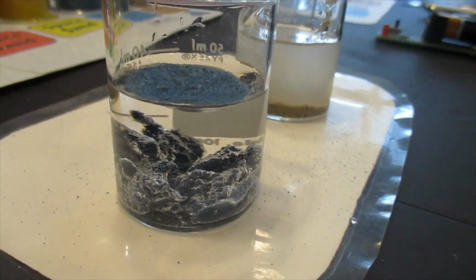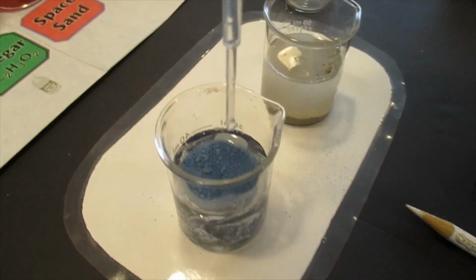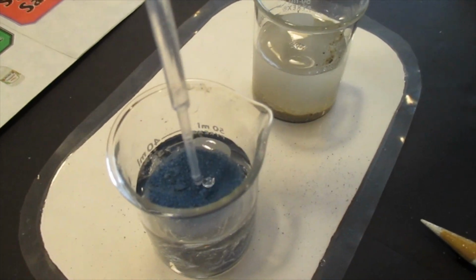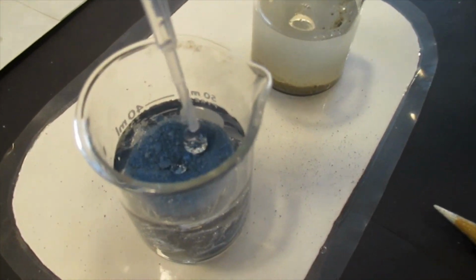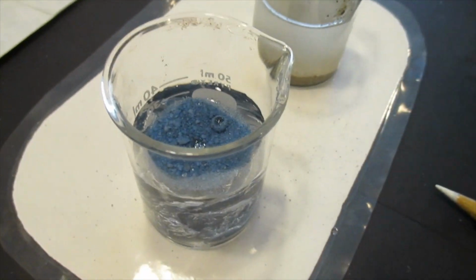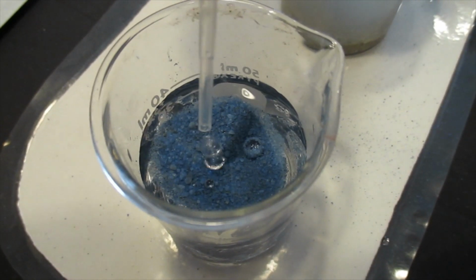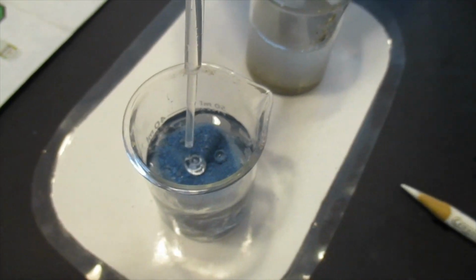Now, take a drop of water, take the micro pipette, and put little drops on there. Just a few drops, see what happens. What is happening there? Yeah, it's growing when you put drops in it. Okay, let Lucy put some in. Try to get in the middle. This is a micro pipette, a little dropper.